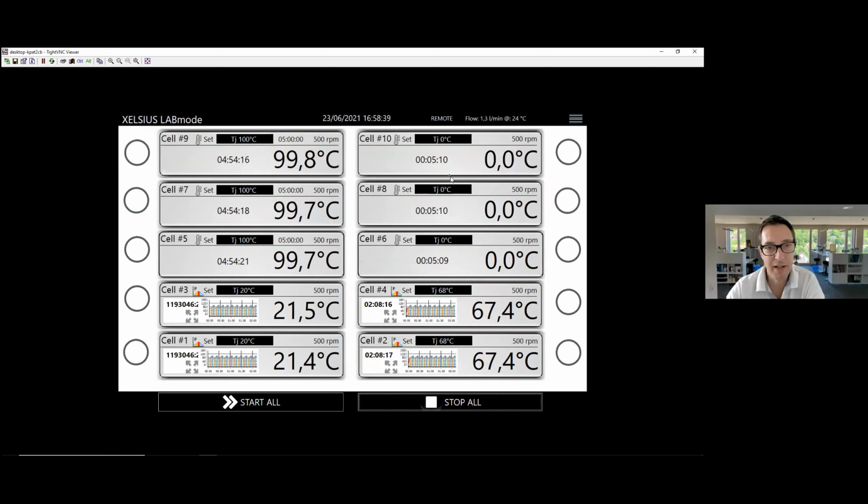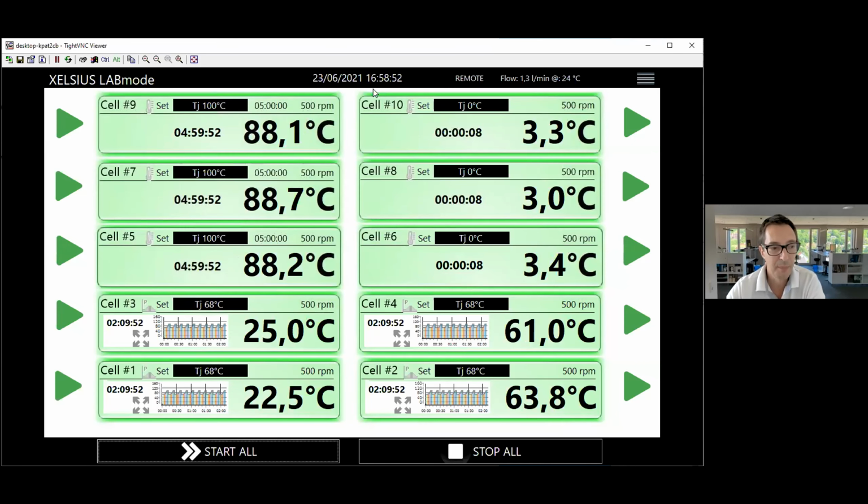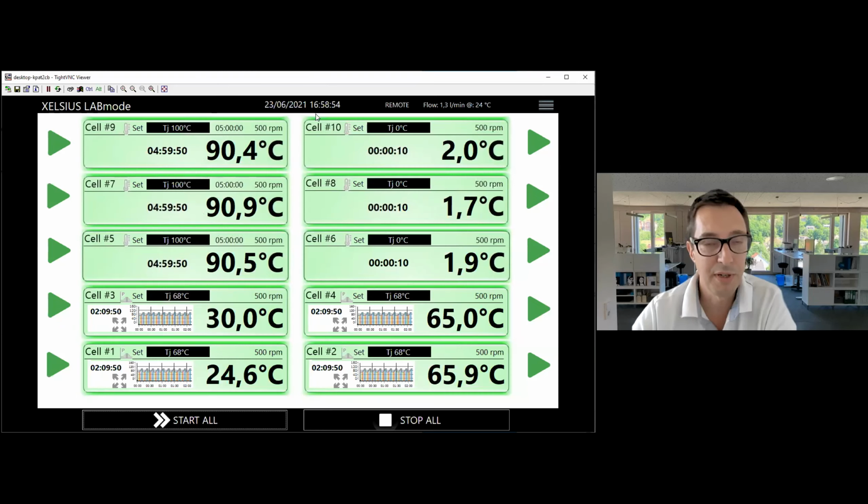So, and I think everybody has seen that it's not just a reaction block. It's also equipped with a small liquid handling arm with the functionality to take samples. And the samples can then be transported manually or in an integrated robotic system to HPLC and analytical instruments, and then produce the data that later on will be processed by Virscidian's Analytical Studio.